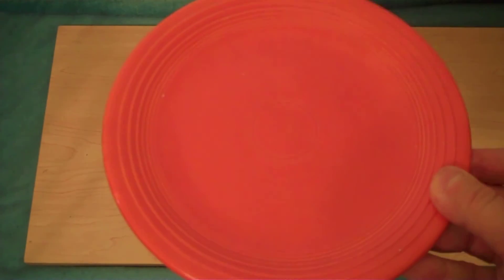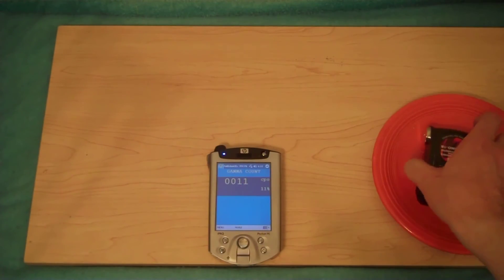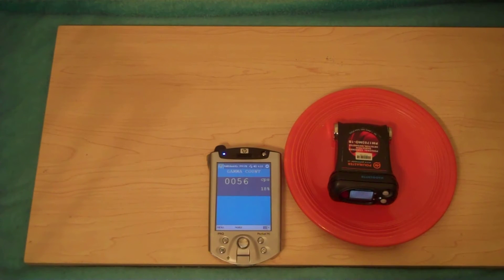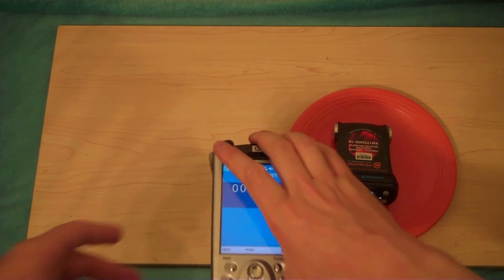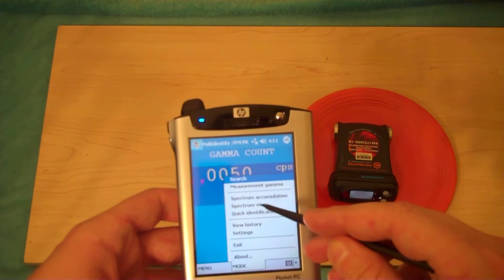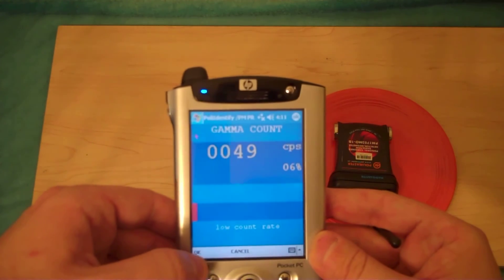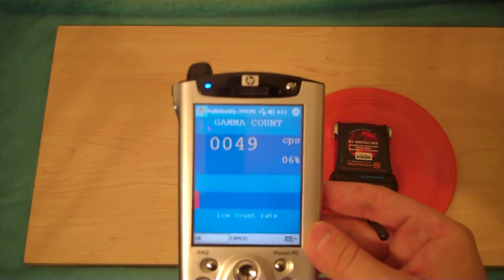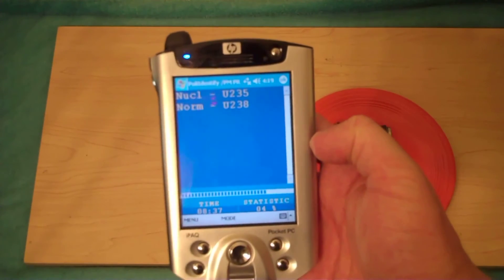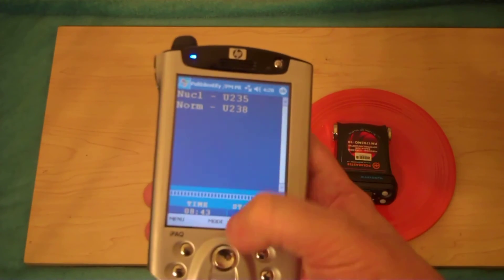Let's take something else — this is a Fiesta ware plate, and this has depleted uranium in it, which is kind of funny. People used to eat off of this. Let's see what we find in this depleted uranium. We should find uranium-238 and uranium-235. The ratio should be a little bit lower than normal — normally around 0.7% uranium-235, but I think it's about 0.3% for this unit. Just a few minutes later, we have uranium-235 and uranium-238 confirmed. On the PC version, it will actually do an enrichment analysis, but the little handheld one does not.